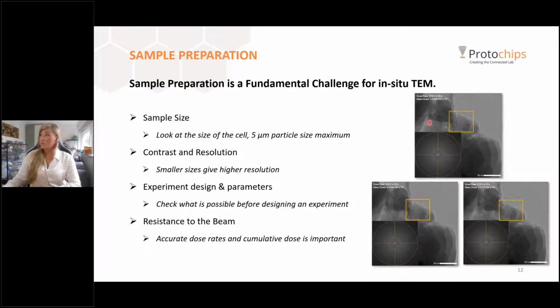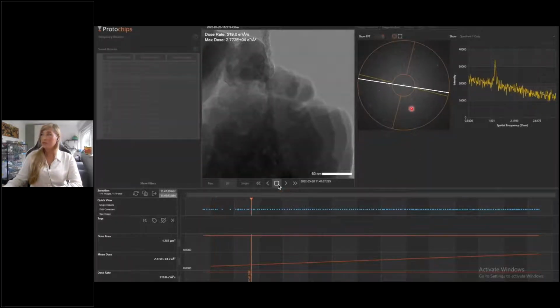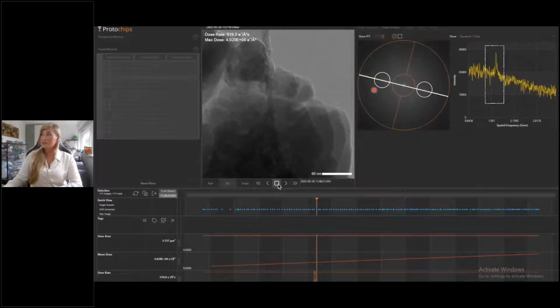In the beginning, when we start measuring in TEM mode, we can see beautiful FFT spots here. And we can see that the sample is nicely crystalline, which is something that we expect. But after a while, using a dose rate of 519 electrons per angstrom square per second, these spots start disappearing. We can see that even better when we are looking in the software. We can see that these spots are disappearing over time. We don't see much difference on the zeolite itself. They might be shrinking a little bit, but we don't visually see anything different.